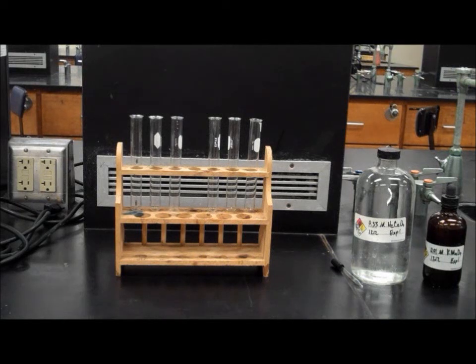In part B, you will record the reduction rate of the permanganate ion in solution by reacting it with oxalic acid. The equation shows how permanganate and oxalic acid react to form manganese ion, water, and carbon dioxide gas. Oxalic acid is oxidized to carbon dioxide in this reaction, and the permanganate ion is reduced to manganese ion.